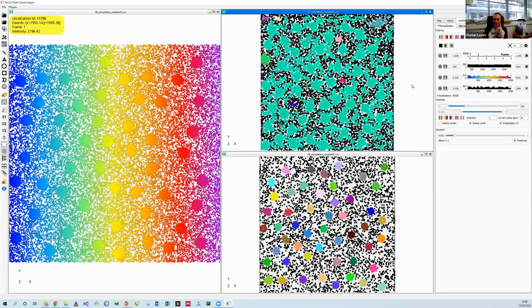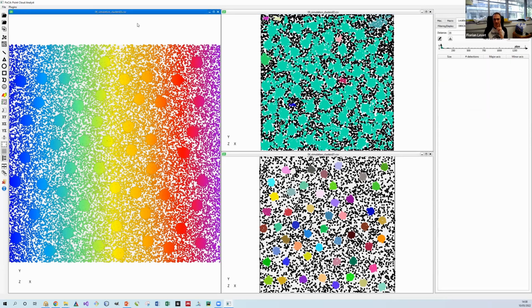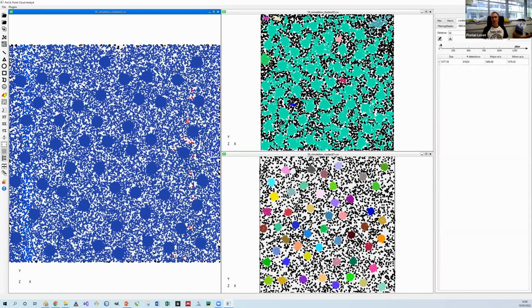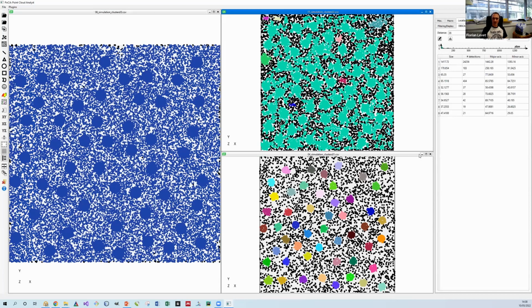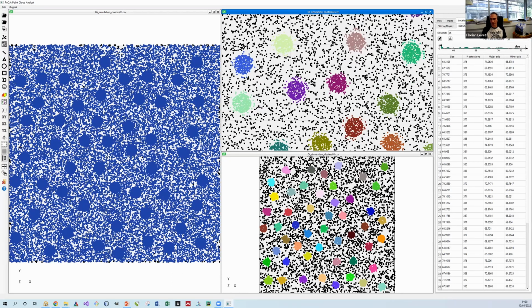we can see that already we have something very bad. Basically, it segmented a big object with everything and a few in the background. And I think that it will be even worse if we do it here. You will segment everything, I think. Exactly. So you see that in order to be able to segment this data now, I will need to change some parameters. So I don't know, maybe I will need to put 35 here. It begins to be better, still a little too big, so you will need to go maybe like that.